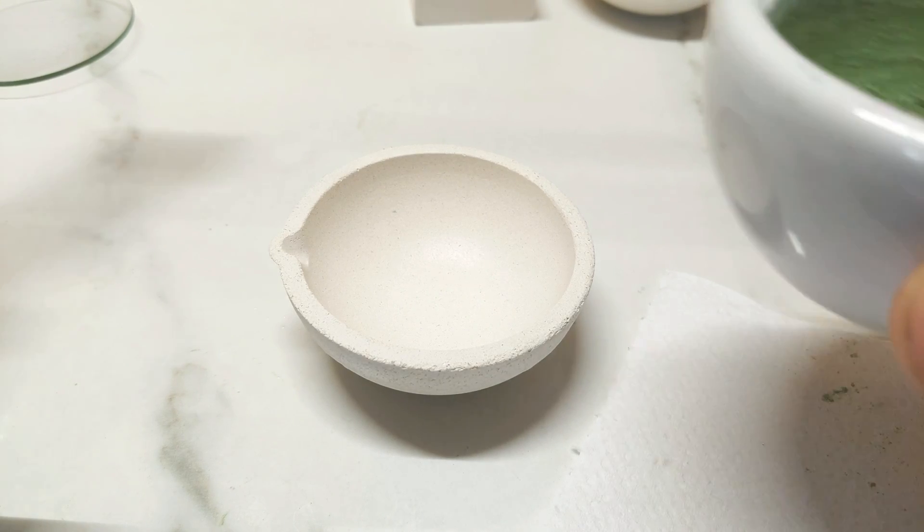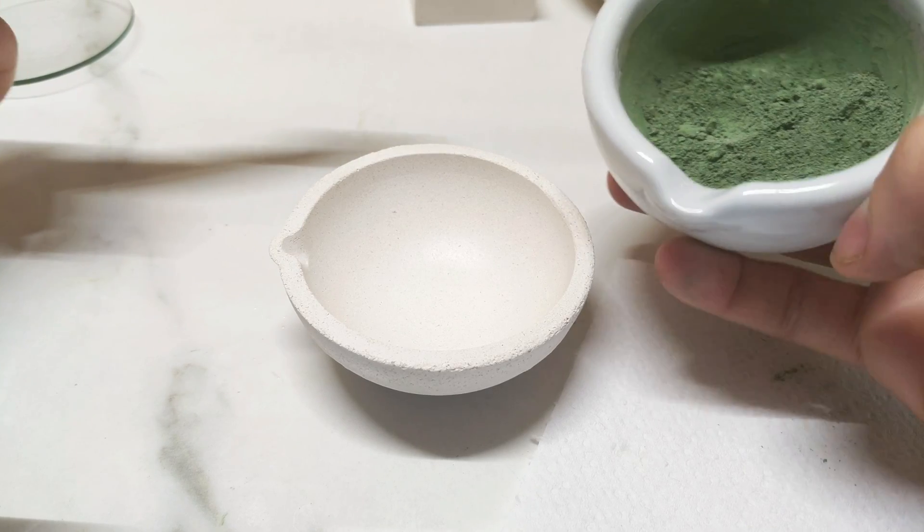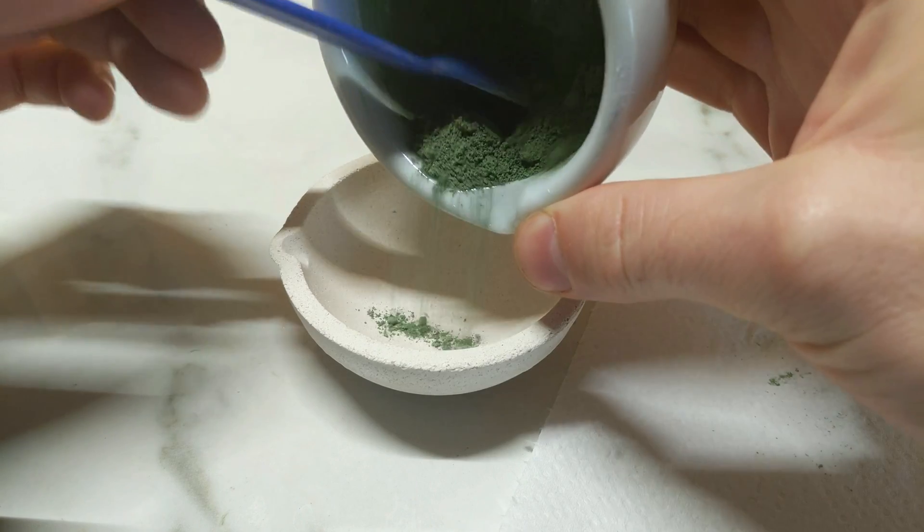After a decent amount of mixing in the mortar and pestle we have a greyish-green powder resulting, which I'm just going to load into the crucible.